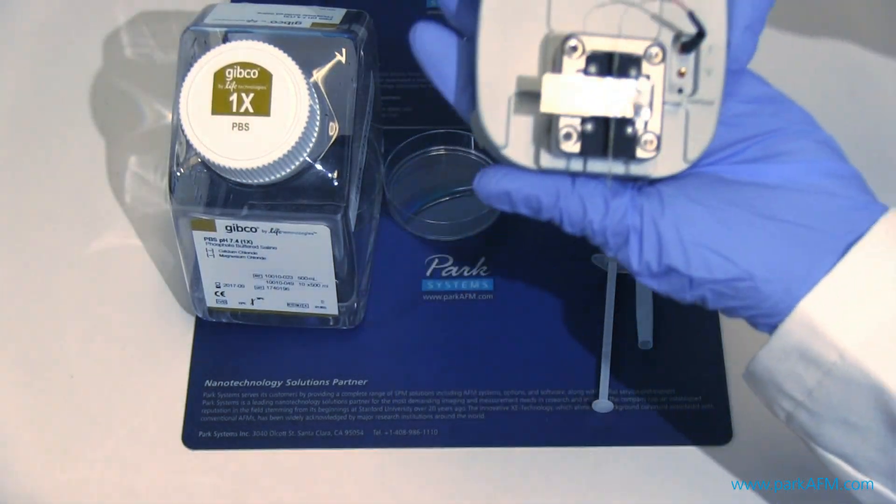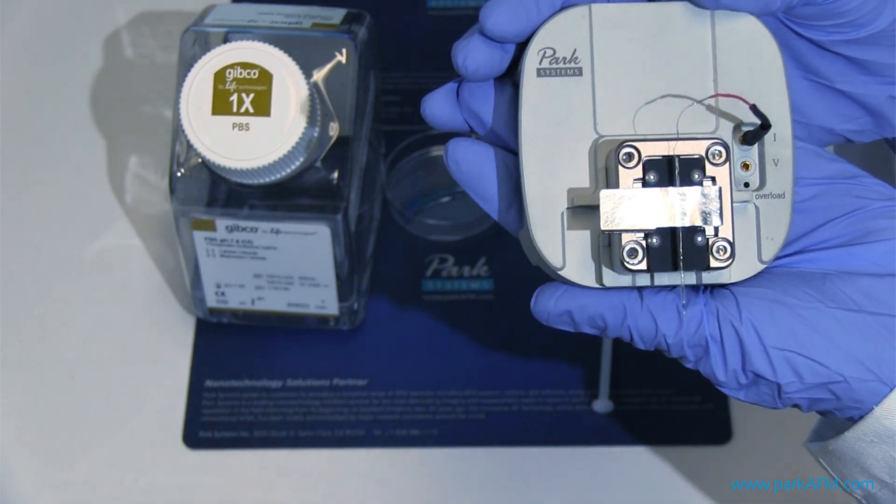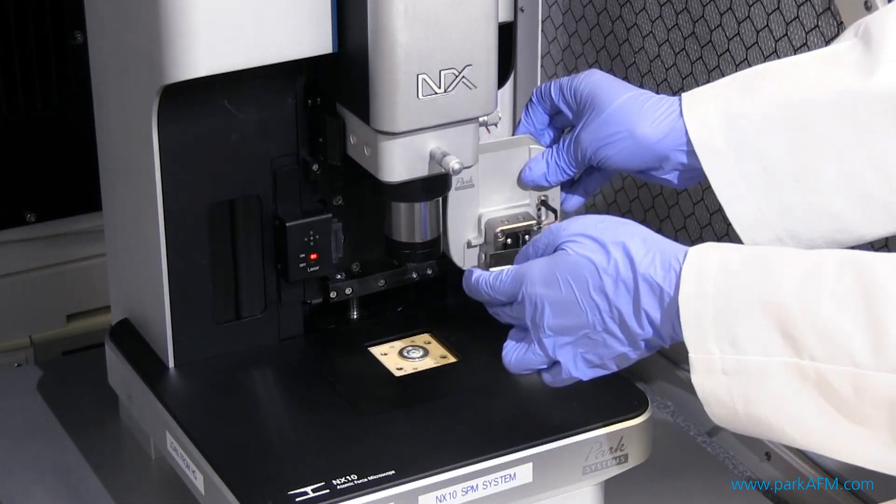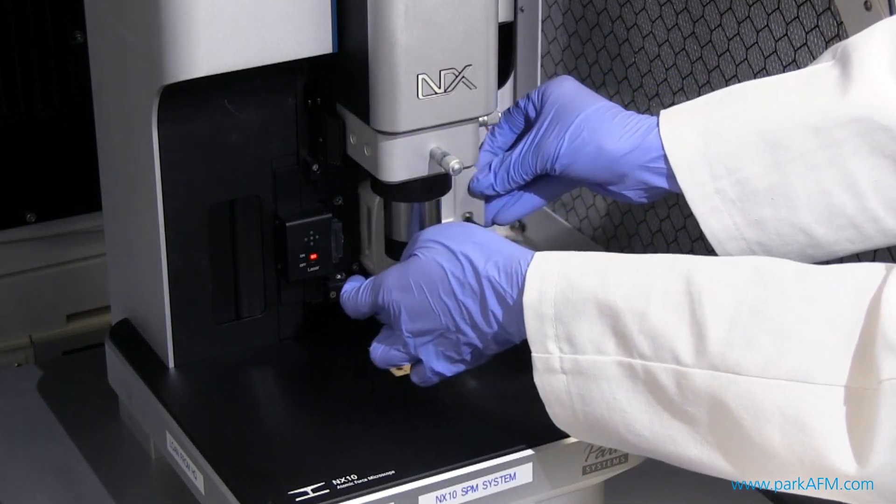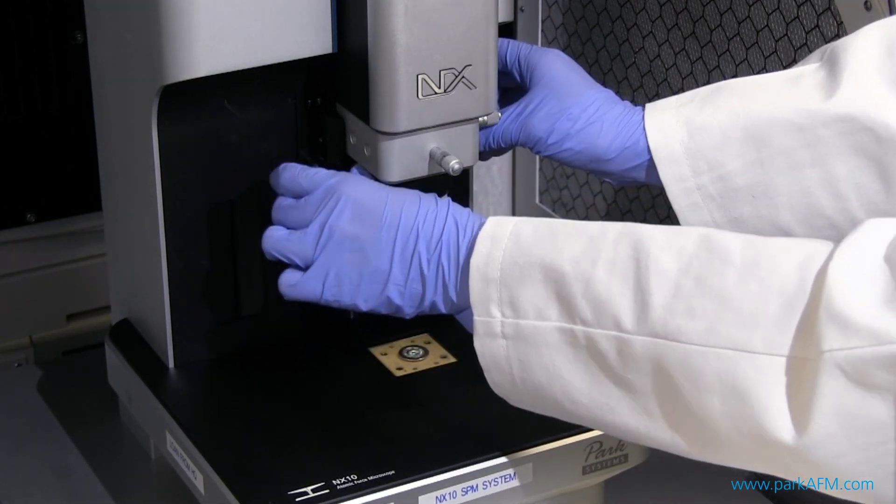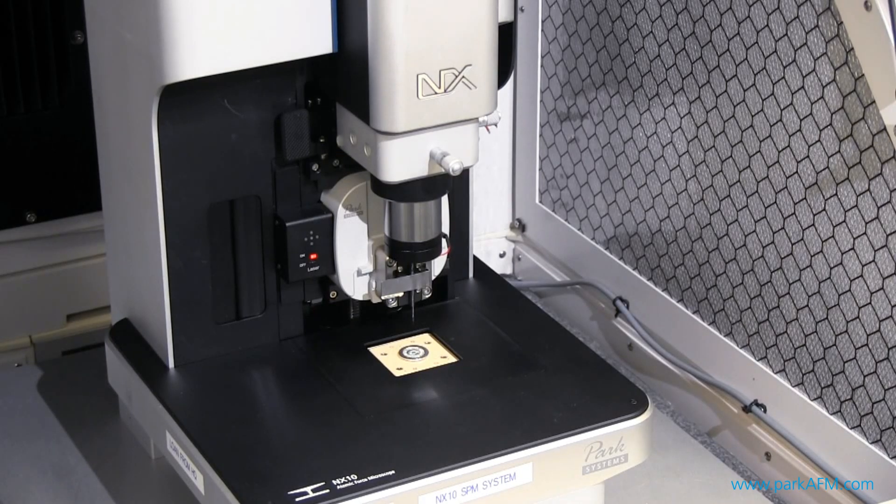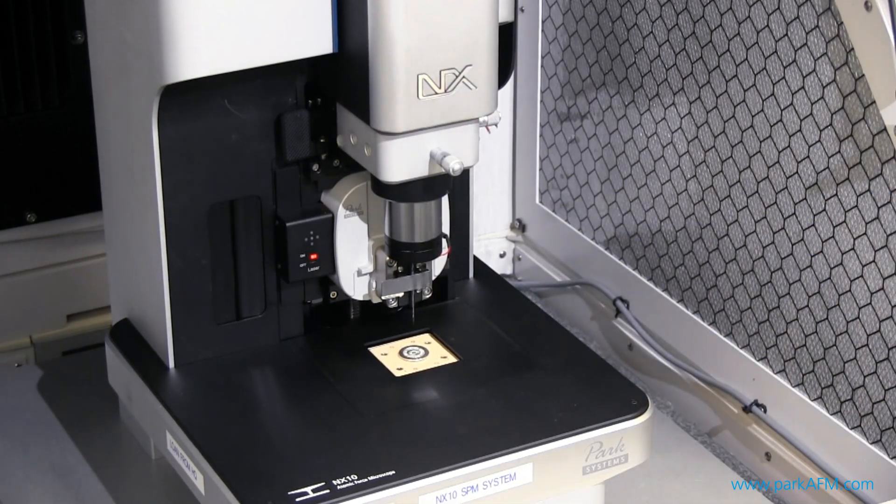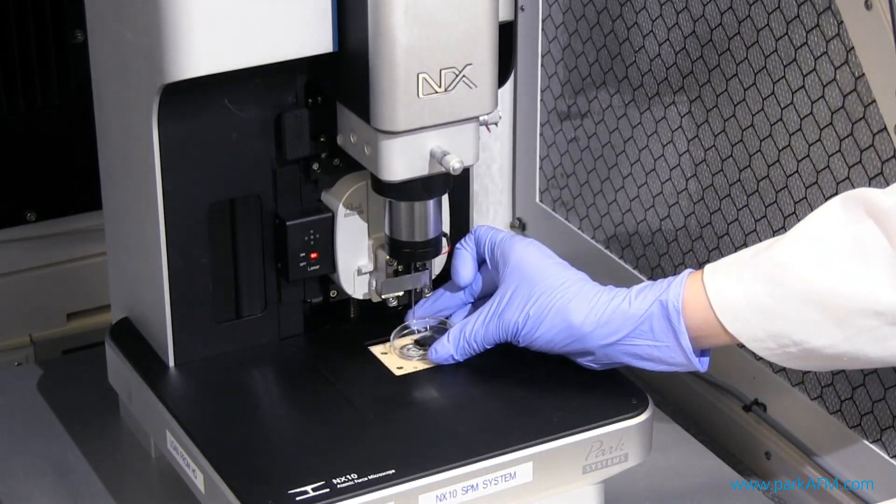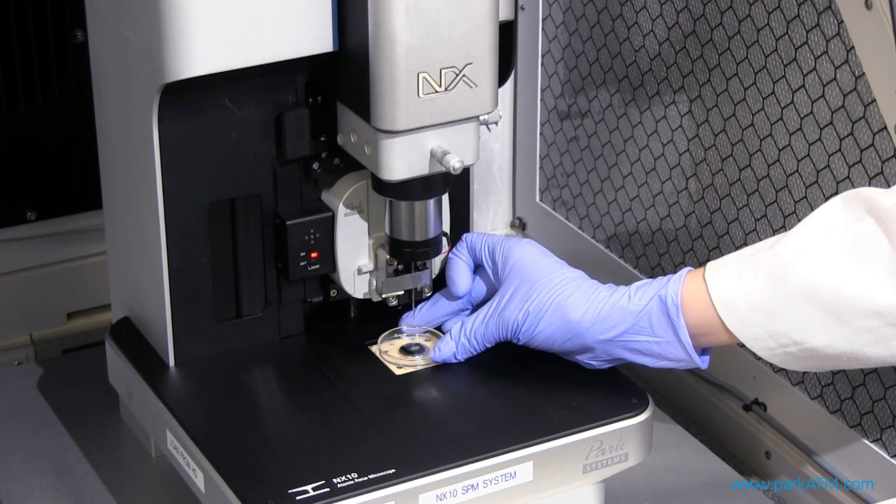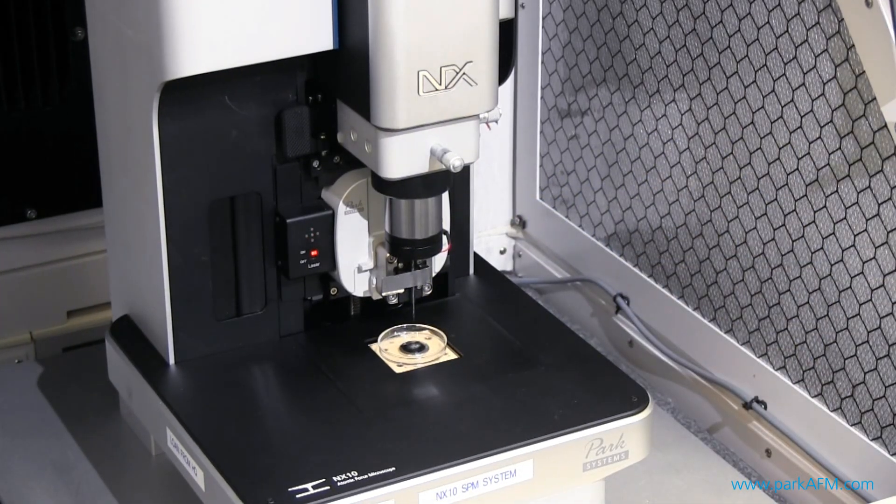When the pipette is ready, put the head back on NX10 by sliding it onto the dovetail rail and then lock it into place. Make sure there's enough space between the end of the pipette and the sample surface. Now place our collagen sample with buffer in a petri dish and put it on our sample stage.